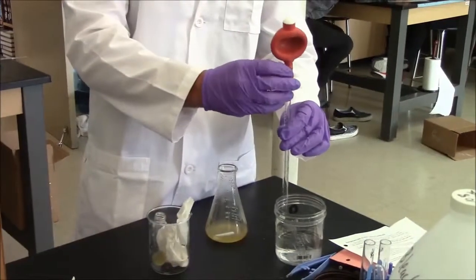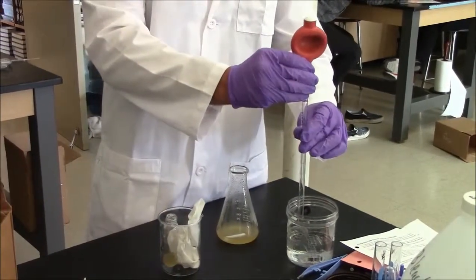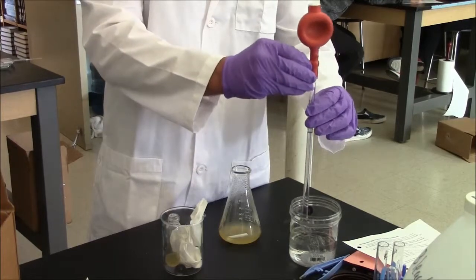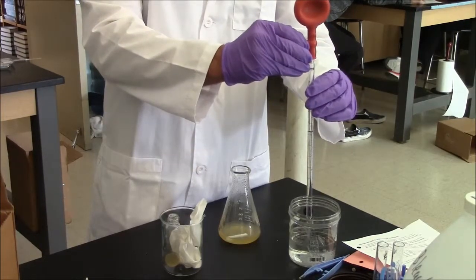After pipetting the cells, you'll want to sterilize the pipette by pipetting up and down 10% bleach. That will kill the bacteria that were in the pipette and make it safe for disposal.